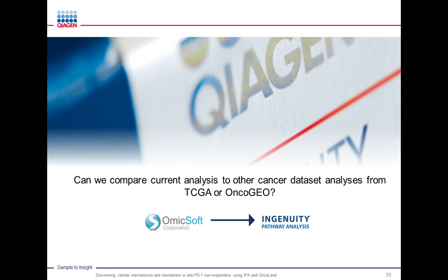Every single time you upload any data set or any comparison in IPA, and by comparison, I'm talking about a non-responder versus responder comparison, your comparison is automatically compared to other comparisons. These other comparisons can be your own, or they can also be public comparisons. So in simpler words, your IPA analysis is compared with your other IPA analyses. If you have treatment 1, it will be compared to your treatment 2, 3, 4. And it is also compared to public analyses of different data sets.